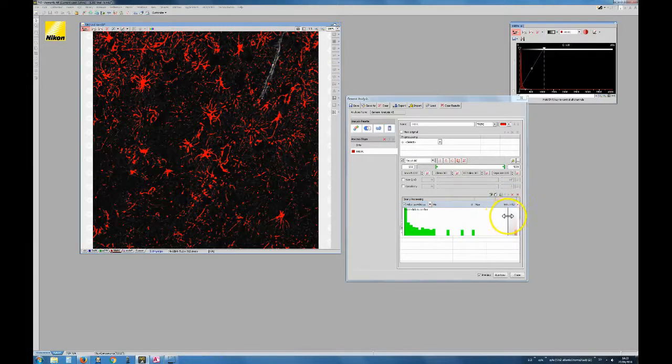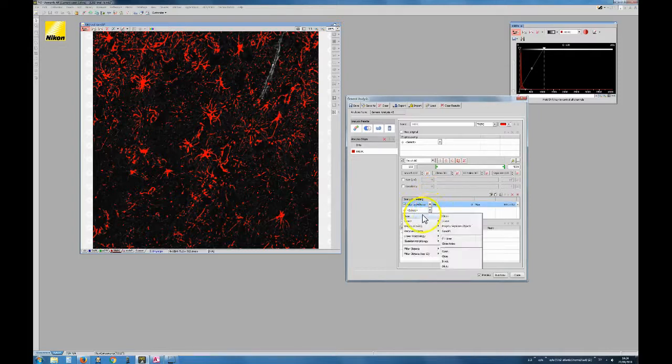So I can filter my binary objects in the binary image by using all these filters that we have here. I have a lot of different types of filters, tons of them. Okay, so you can play with them and figure out how you want. For example, you can select only the objects that are very rounded or very elongated, or something like this. There's always a special orientation. Okay, so now I have thrown away the very big stuff.